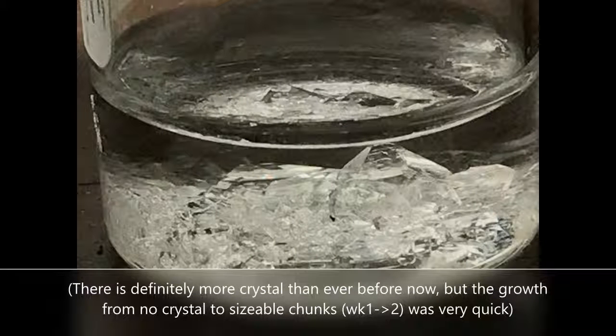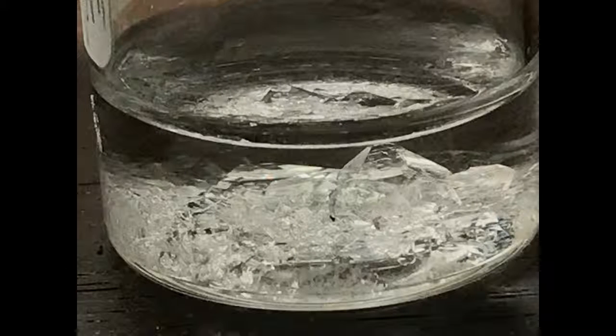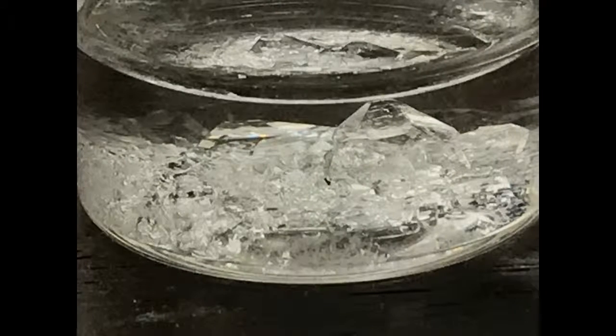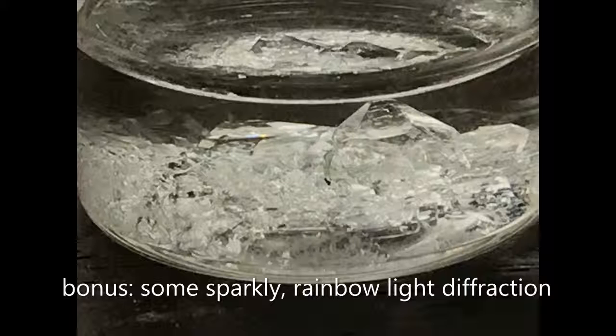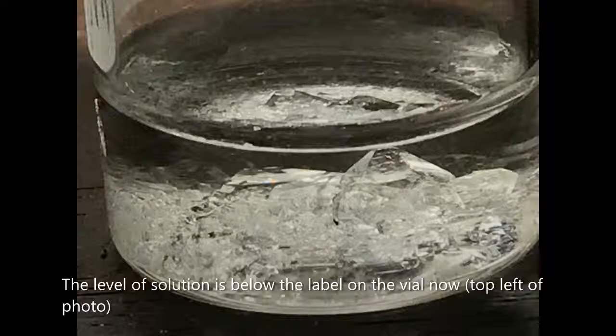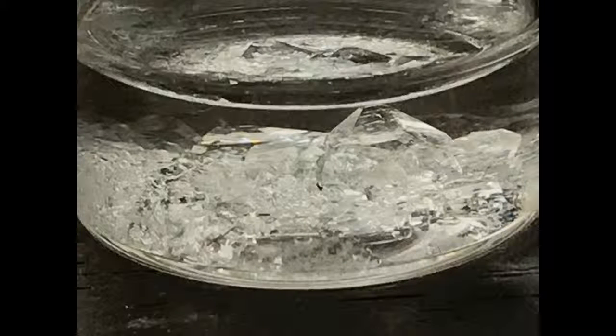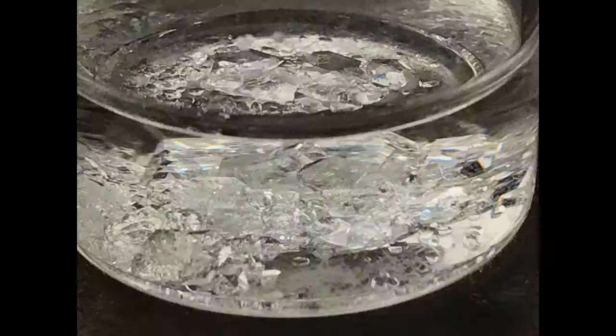As explained earlier, this may be because of the decreased amount of solution, and the crystal thus may be nearing the end of its growth process in terms of the amount of solution that we've added to this vial. The volume of solution left in the vial is indeed much less than the volume that we had seen before. At this point, the crystals are fairly large and fairly clear, so I would consider my attempts to grow alum crystals fairly successful.